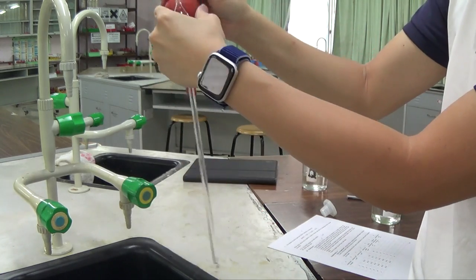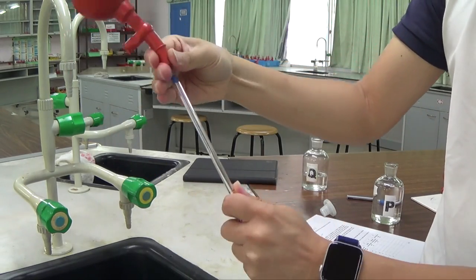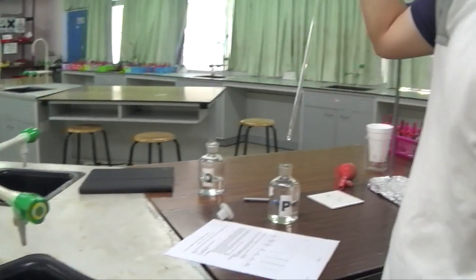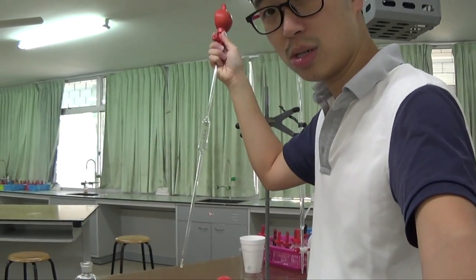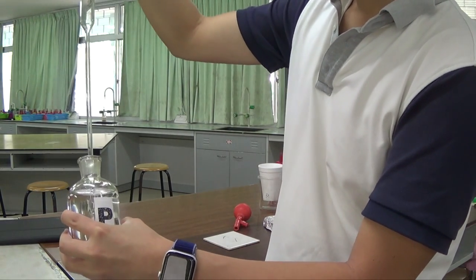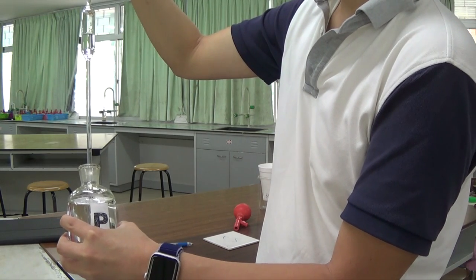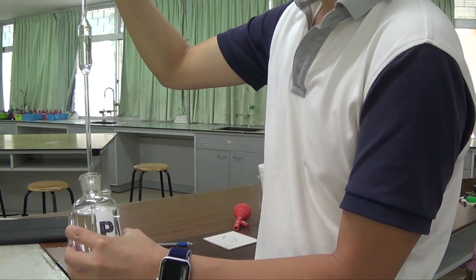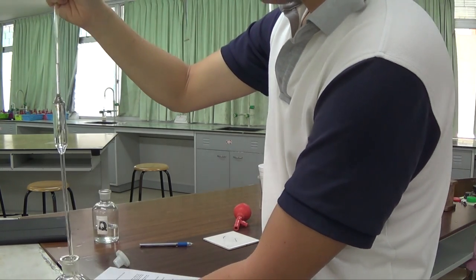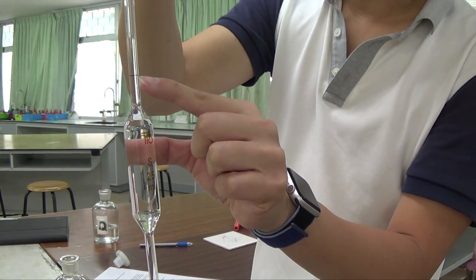Now I'm going to really take out 25.0 cm³ again, push it in, but then rotate around until it's tight. I want to take 25.0 cm³ of P, so I hold P at an angle. Somehow it helps. If you hold it horizontally flat, sometimes it's a bit slower, but I don't know. I've always learned it that way. Never really understood the physics. So you have a line there that represents 25.0 cm³.